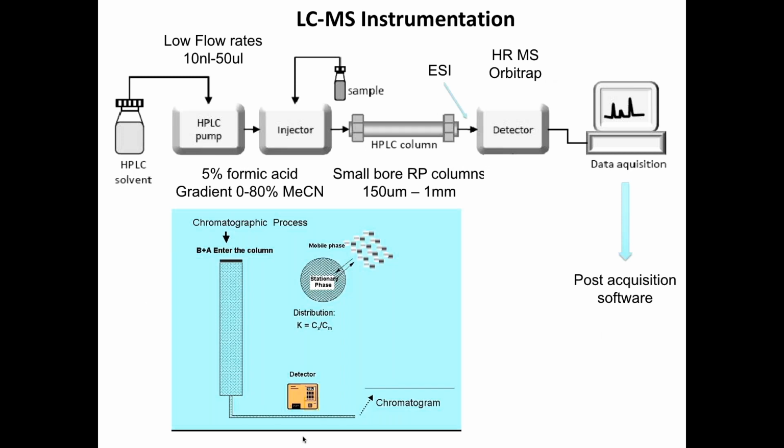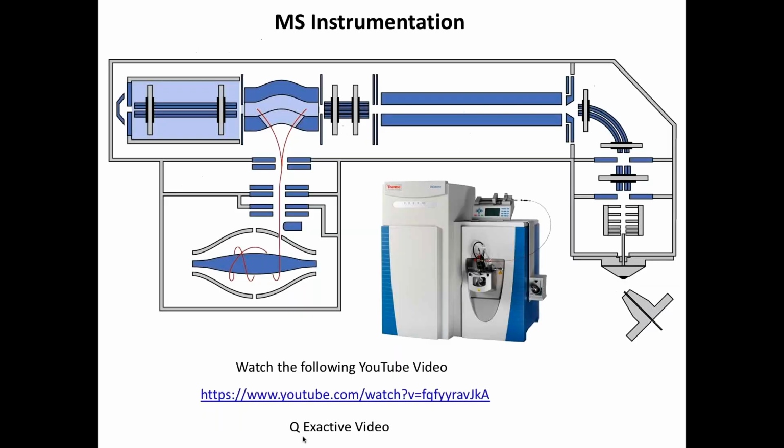I'm sure everybody here knows a lot about HPLC, so I just threw this up here for the biophysics class that I teach. We're using capillary LC systems, relatively low flow, not nano flow, because that wouldn't be robust enough for this experiment, particularly since we're doing very large protein complexes often in complex buffers. Our quench buffers are quite harsh, and we're running multiple time points on a lot of replicates. So we need the system to be robust. So we're not doing what the proteomics core would be doing in terms of nanospray.